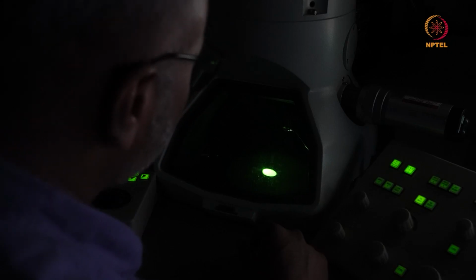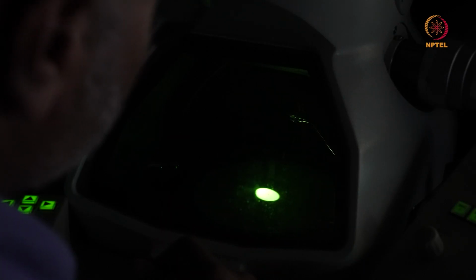But the first step is, here the center point is more or less aligned. I can do it even finer, but typically you will not improve significantly. Perhaps at this point, it is more or less corrected.